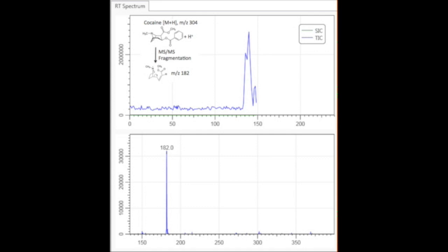That is the fragment for that 304 ion - this is the MS/MS spectrum for that 304 ion. What this tells us is we had something with a mass of 303, and in protonated form 304, but that mass also fragments to give us a 182. These facts together allow us to give a positive identification for cocaine, because only cocaine is going to give you a peak at 304 in the MS1 spectrum, and then when you isolate that 304 and fragment it, give you 182 in an MS/MS spectrum. You can see here in this image that's the actual fragment that adds up to the 182 for that peak.